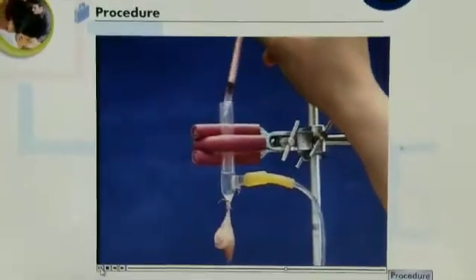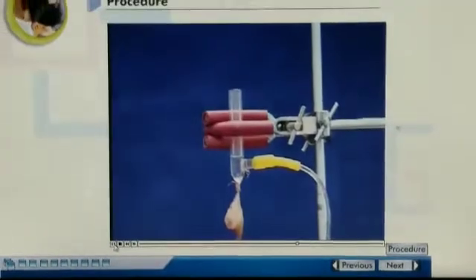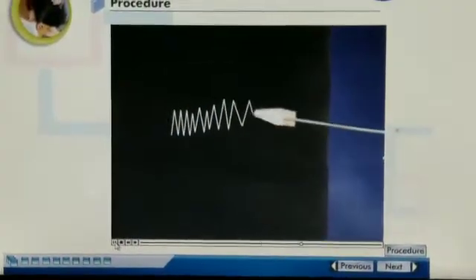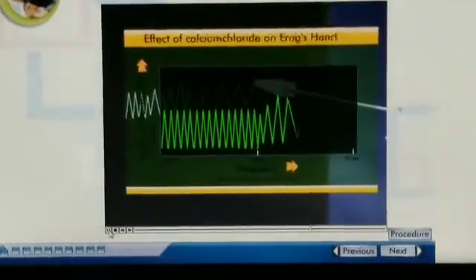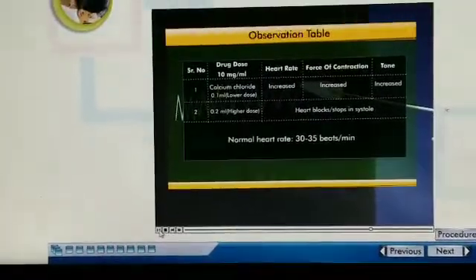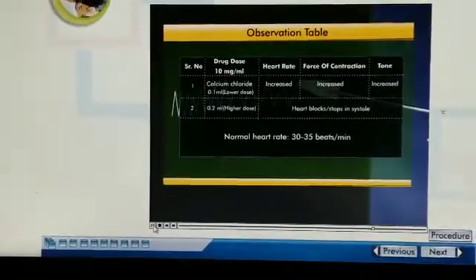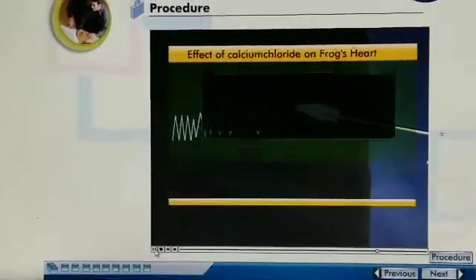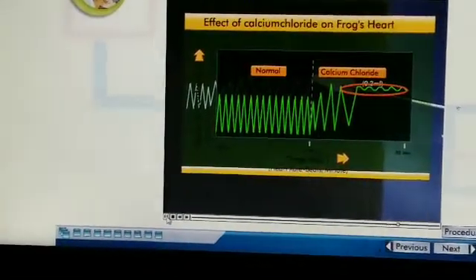Similarly, inject 0.1 ml of stock solution of calcium chloride into the cannula and record the response of the heart on smoked paper for one minute. We can easily see that the force of contraction, tone, and rhythmicity are increased. Repeating with 0.2 ml of calcium chloride, we observe that with increasing concentration, the heart contracts more vigorously and finally stops in systole.